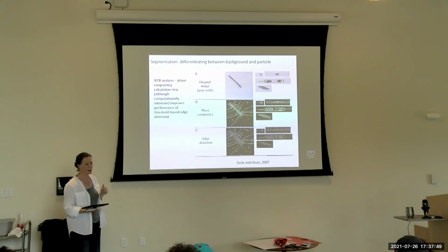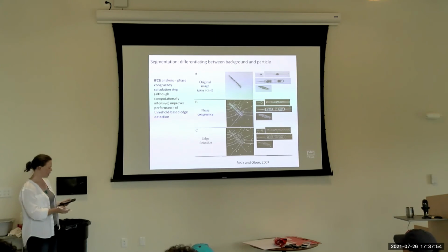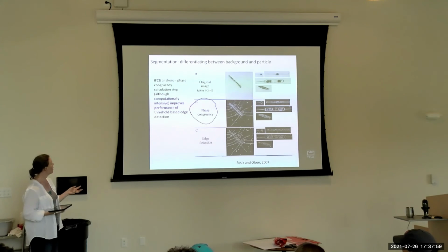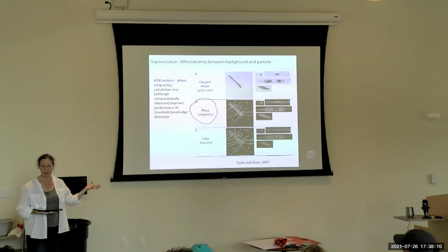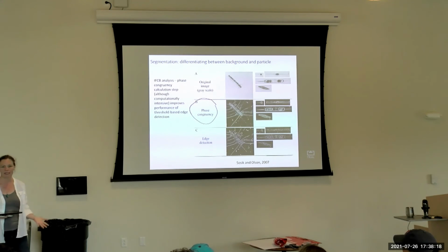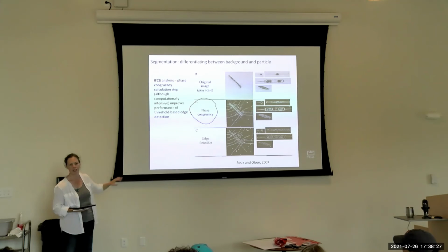The Imaging FlowCytobot particle sizing algorithm includes a middle step, which is computing the phase congruency. It's doing a Fourier transform on the image, basically looking for places where you've got these phase contrasts in the image. But this seems to improve the performance of a threshold-based edge detection algorithm. And so you end up getting a less ambiguous edge detection.